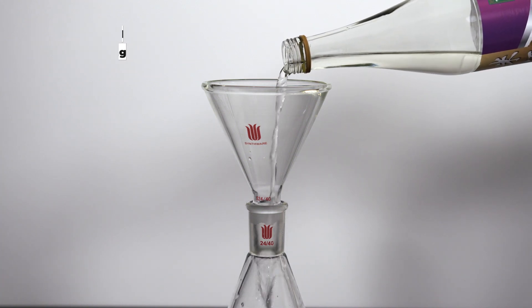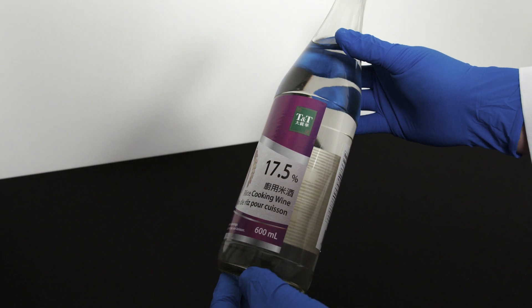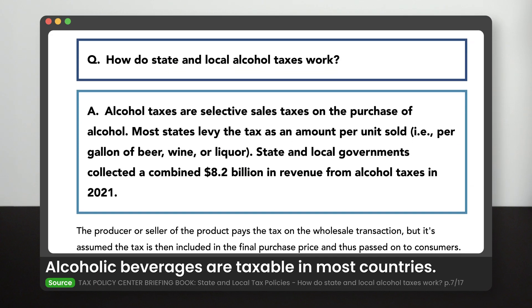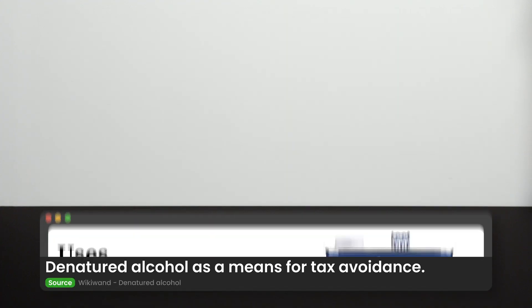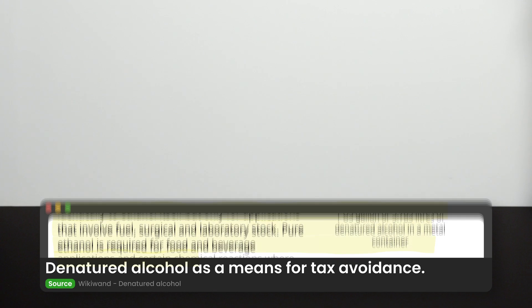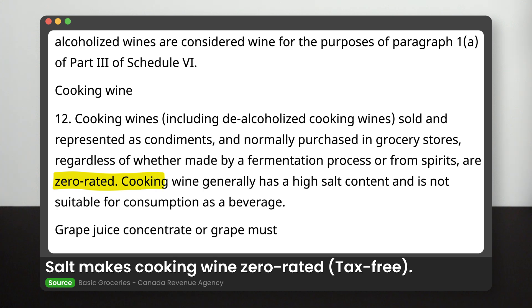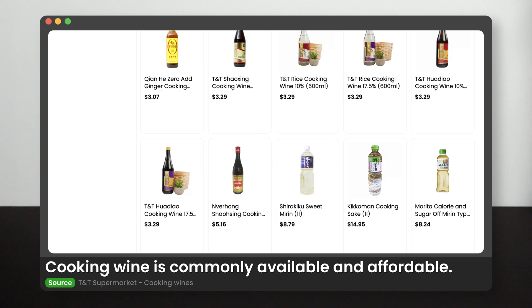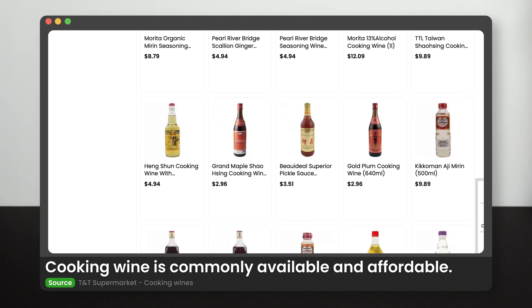While we wait for the ethanol to heat up, let me explain why I choose cooking wine as a source of ethanol. Alcoholic beverages in most countries are taxable, meaning a portion of the price is just tax. This sometimes also applies to reagent-grade ethanol, unless it is denatured with undrinkable impurities such as methanol or isopropanol as a means of tax avoidance. Another way to avoid tax is to introduce a small percentage of salt into ethanol, which makes it taste bad for drinking. This is why cooking wine is probably the cheapest source of ethanol, and it is commonly available in supermarkets in most countries — the go-to source for amateur chemistry.